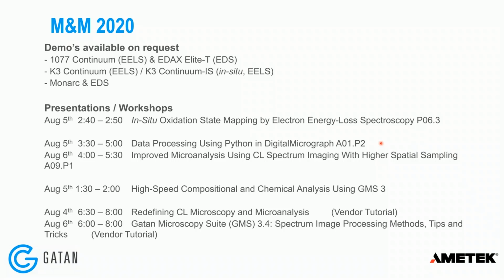We just would use the omega Q slit and a different software option for the acquisition that would give you a non-dispersive axis, which is in an angular unit instead of a non-calibrated unit. So yeah, it's pretty cool. And that's also going to be beneficial with the counting detector, because in omega Q you can have a fairly weak signal, so the benefits you'd get from the super low noise of the counting detector would be quite exciting, I think, to use in an omega Q regime.